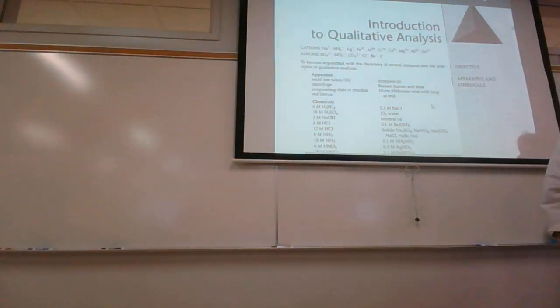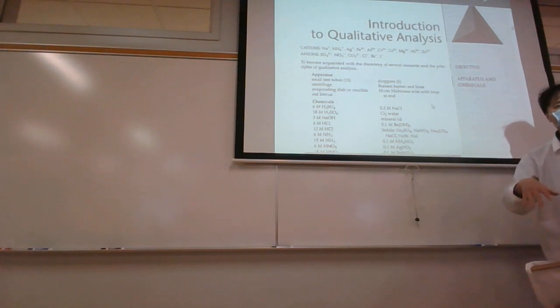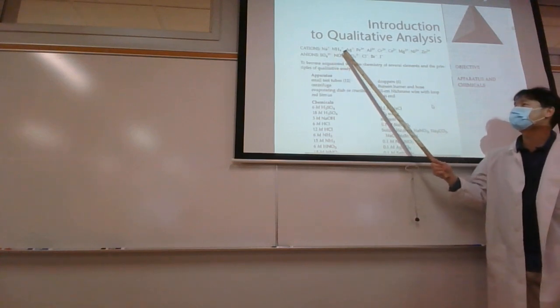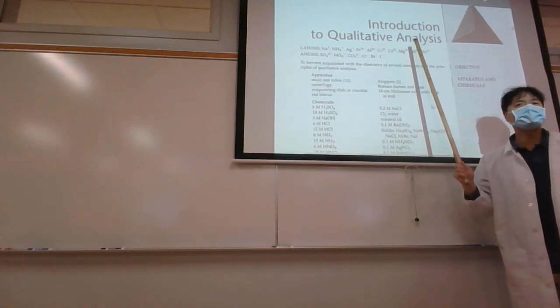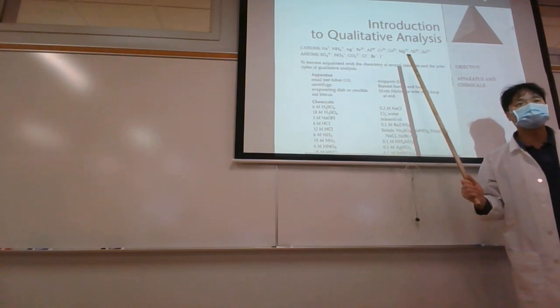So we're going to be analyzing at least 2 samples, maybe more, depends on how much time you have. The first sample we're going to analyze is what's called the known. The known solution has every single one of these. And so you should be testing positive for every single one of these. If you aren't, then something went wrong.